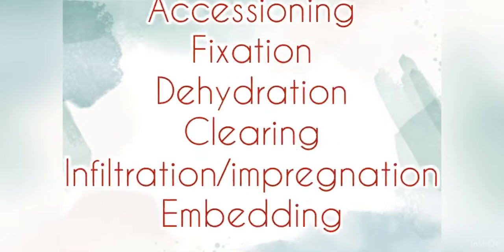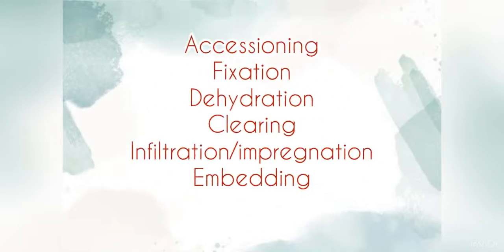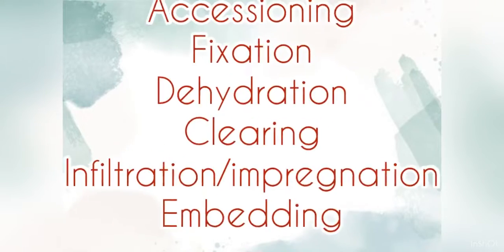That's it for accessioning, fixation, dehydration, clearing, infiltration or impregnation, and embedding.